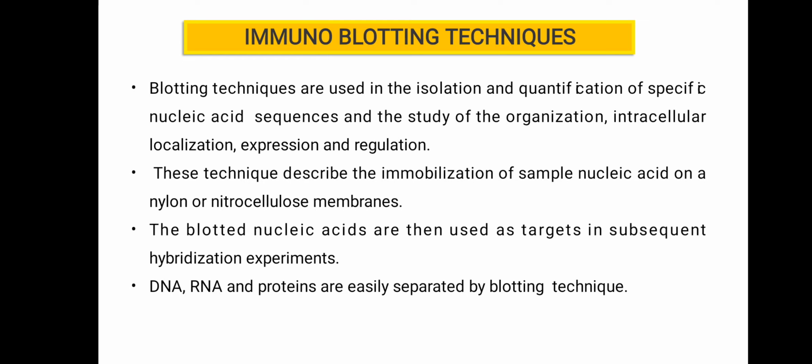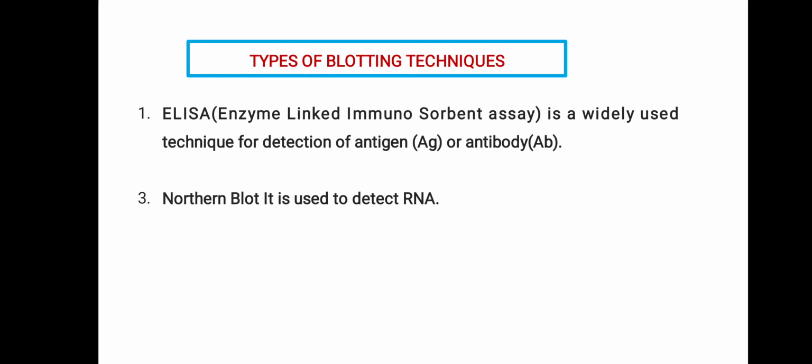So, blotting techniques are the isolation and quantification of specific nucleic acid sequences, and also the study of organization, intracellular localization, expression and regulation.